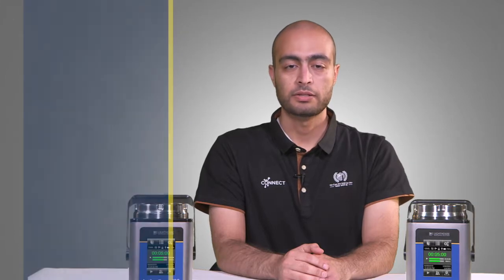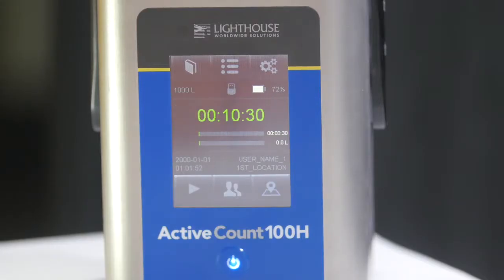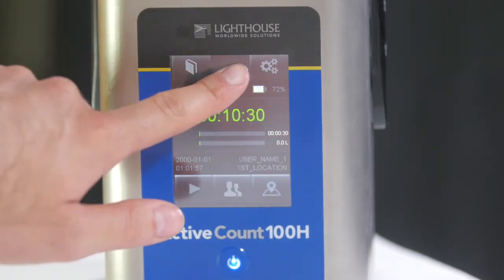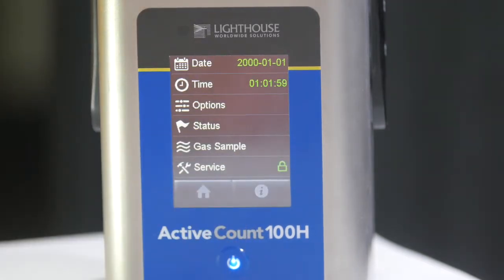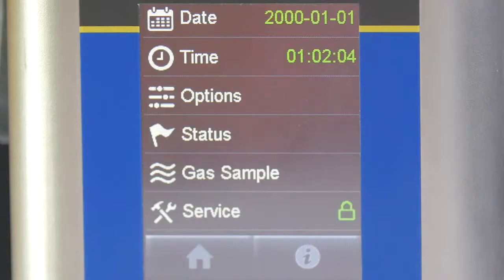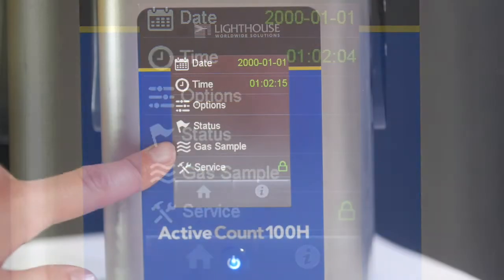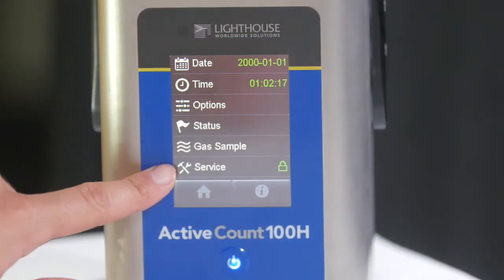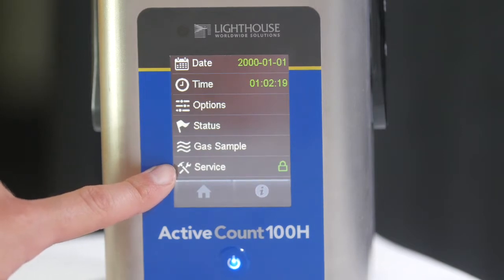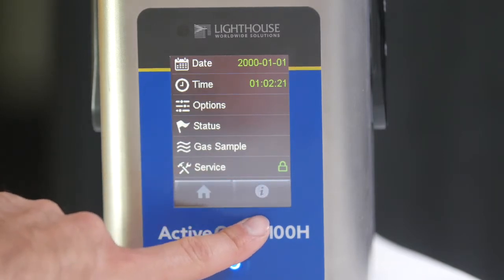To access the settings menu, simply press on the bulleted list icon on the main screen. The settings menu allows you to adjust the date, the time, general options, and it allows you to see the instrument status, adjust compressed gas sampling — which we will be covering in a separate video — calibrate the instrument, which is password protected, and access additional information about the instrument.